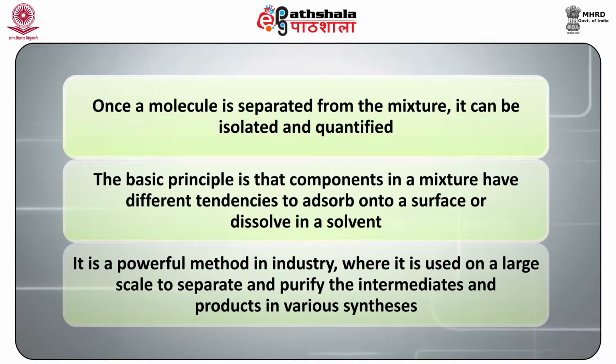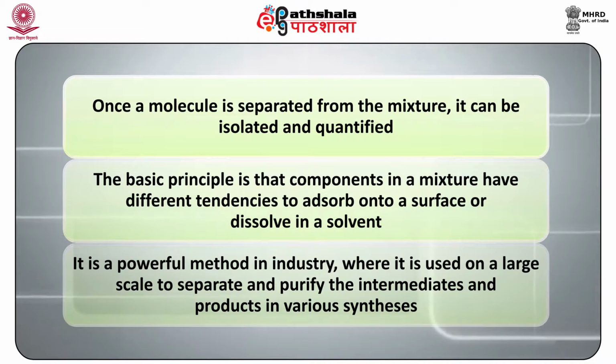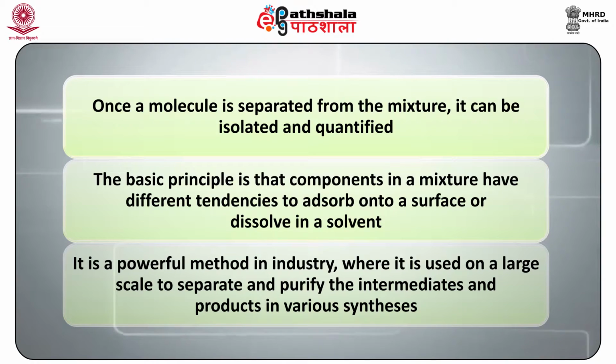It is a powerful method in industry where it is used on large scale to separate and purify the intermediates and products in various syntheses. This is basically the technique of separation on the basis of relative affinity for the mobile phase.